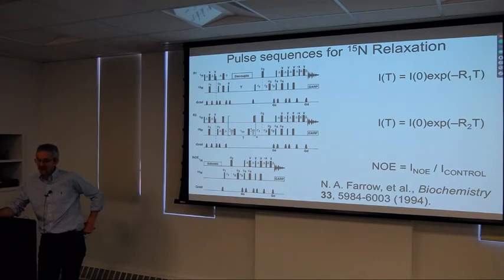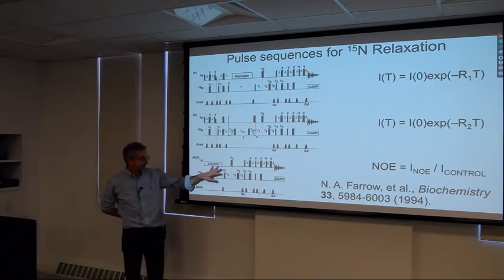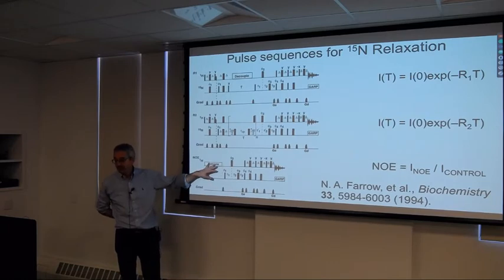And what's the T1 of water? Probably don't have any idea. The T1 of water is 4.5 seconds. So now you say I have to wait for the water to recover to equilibrium. Now we're waiting a very long time. And two things happen. One is we do wait a long time. Typically this might be 12 or 14 seconds. So the experiment is very inefficient.